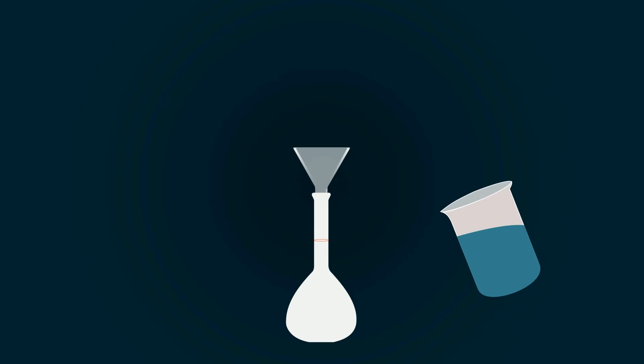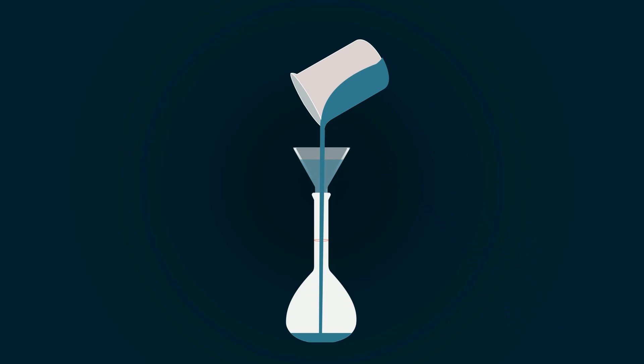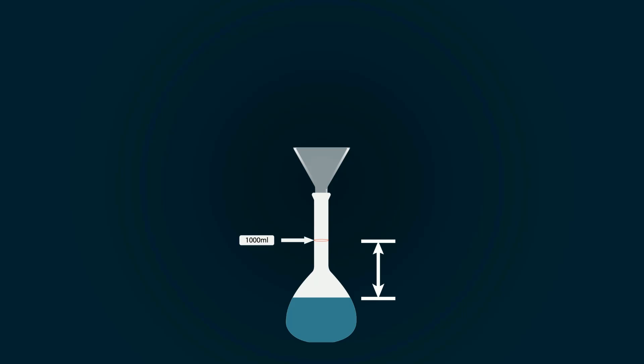Now add this mixture into the measuring flask of 1000 ml with the help of funnel. We must add more distilled water so that we reach the 1000 ml point. So add more distilled water.